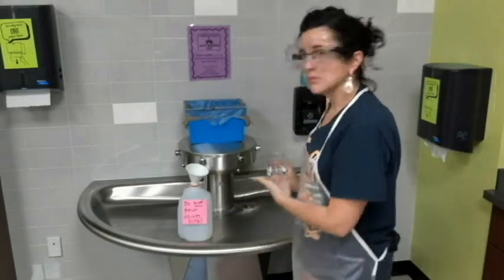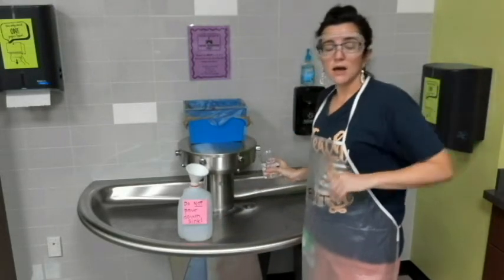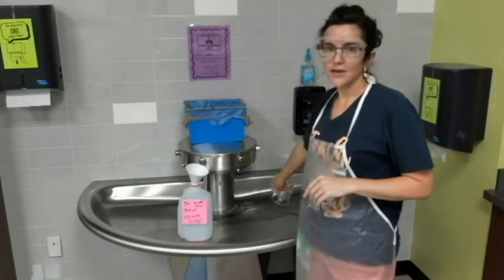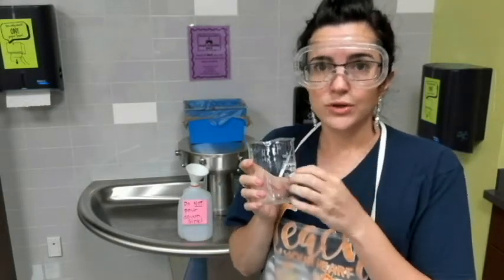Water is definitely okay to pour down the sink, so I can come over here to the hand washing station or the sink behind my desk, and we can just pour that down the sink, A-okay, and then find a place that either your teacher or myself tells you to put the spoons or the tools or the beakers back.